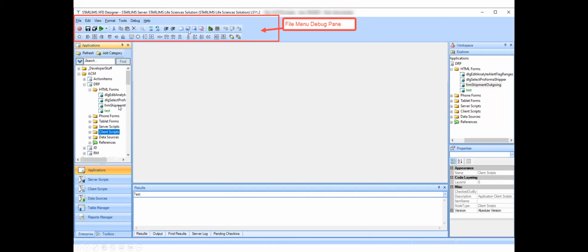For debugging, we have the ability to mark and unmark sections using the numbers on the left-hand side. There's also a debugger incorporated in the tool, and that would be operated from this icon. It enables you to literally play through some of the code behind in the scripts, and it'll open up a secondary window that shows yellow highlighting as you're going through the code, and you can step through it just like anything else. That's what these controls do over here.